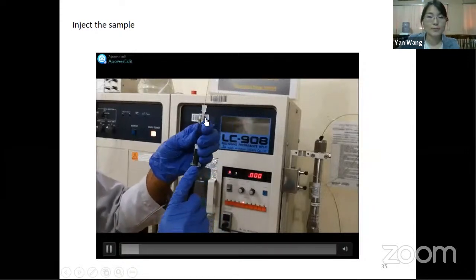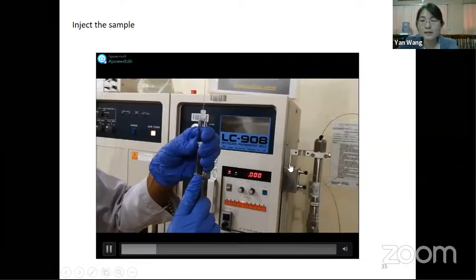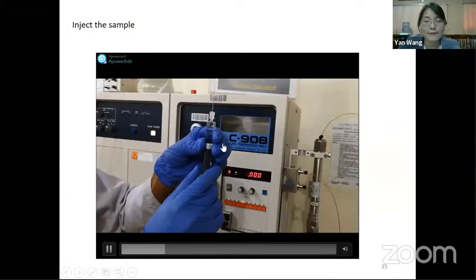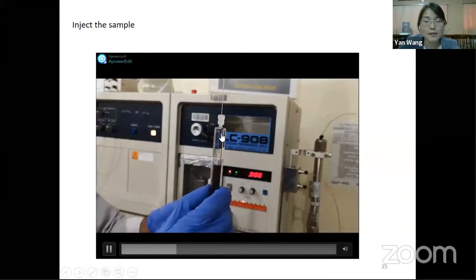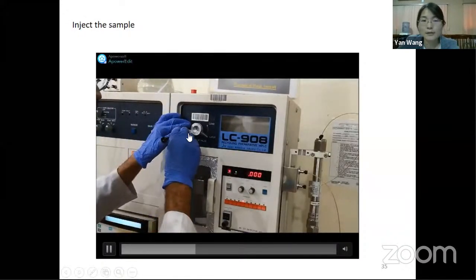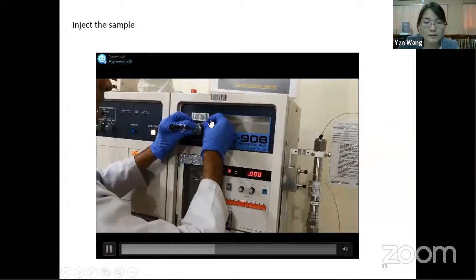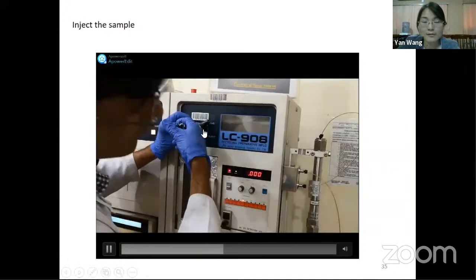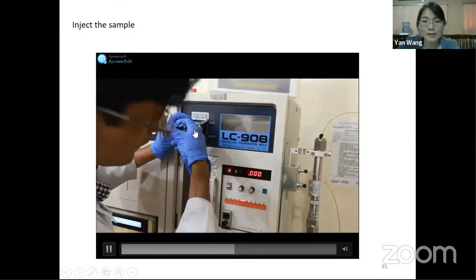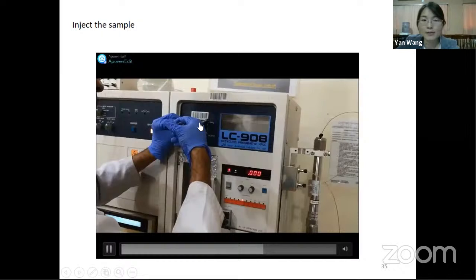You know, we have to make sure the bubbles are removed from this injection. If you have the experience of being injected in the hospital, the doctors work very carefully, and the bubbles should be completely removed, otherwise it's dangerous. So now he injects, and then here he's going to move this to the load mode, and then gently and softly push. Now the sample is going to the loop, right? He prepared 3 ml. All these 3 ml will go and just remain in the loop.